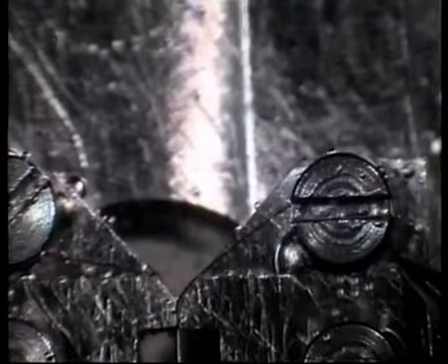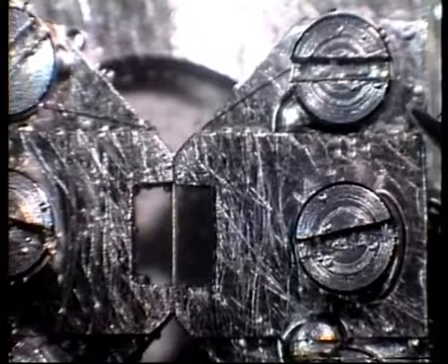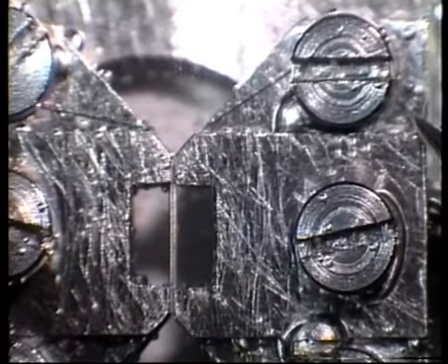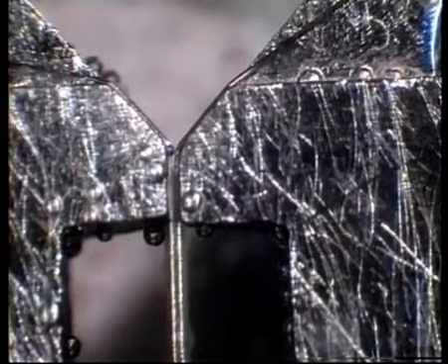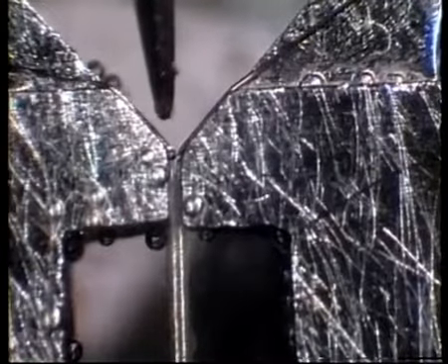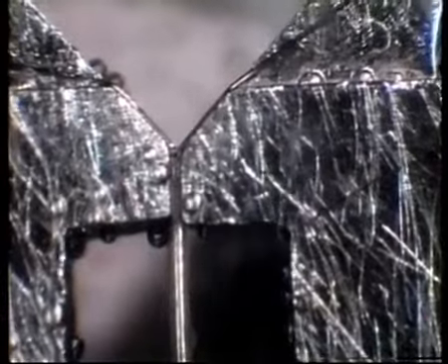Next, bend the top wire around the screw head. Before tightening it totally, move the heads a little distance apart to allow the wires to be tightened. Now adjust the wires so that they are parallel and at the same horizontal level. If they are not parallel, you have to move the wires. Take your forceps and move the wires as shown here. Moving the heads back and forth makes it easier to see how the wires are positioned.